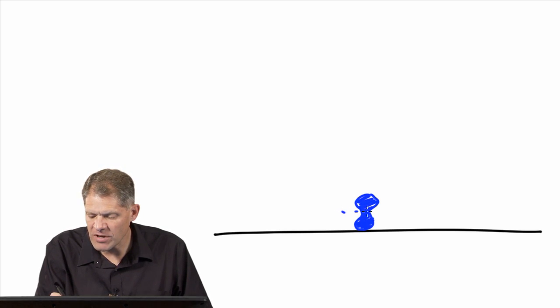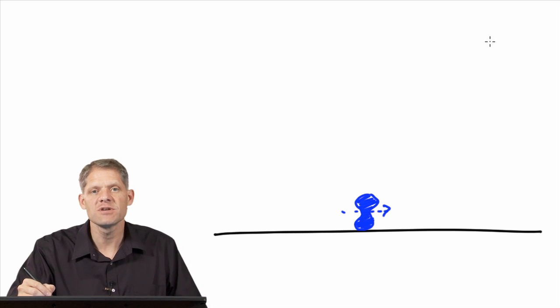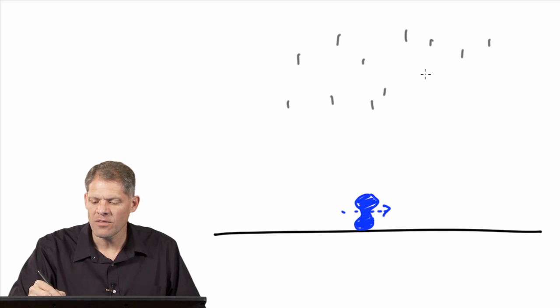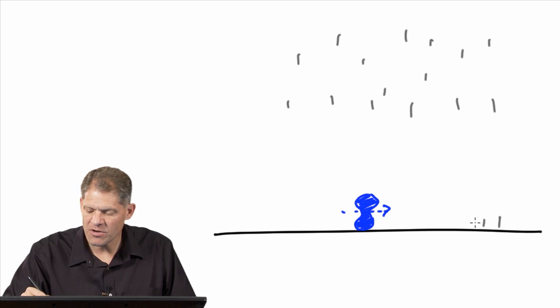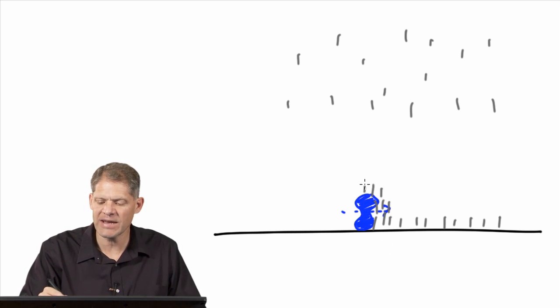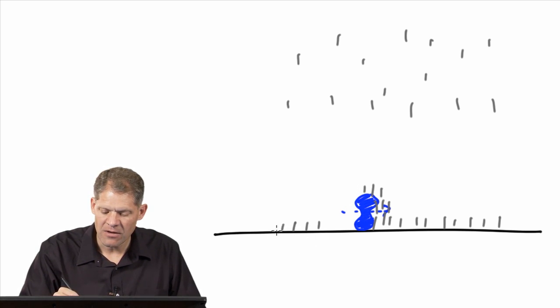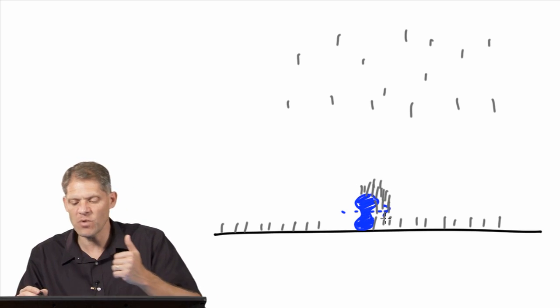So this is moving forward here, around and around. Now imagine that there's some source of clumps of metal that is raining down on the plate. And as it rains down, it produces an even coating in front of the object, but then more of that metal coating is collected on the front side of the object of interest, and then there's a little shadow behind it where the metal that would have fallen here is actually caught on the front face of this object because it's moving forward, sweeping forward.